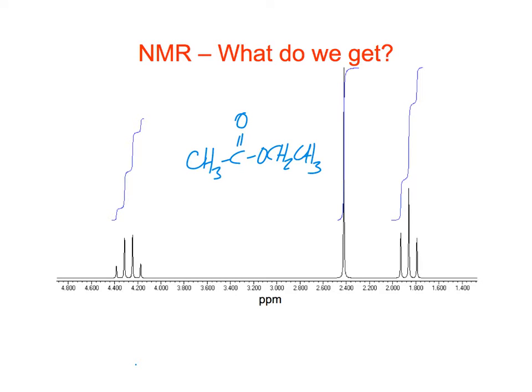But this is a super concentrated sample, and I'm sure they ran it so they didn't have those kind of impurities in there. We'll talk about choosing solvents later, because sometimes, especially if you have very weak, low concentration samples, it's important to choose a solvent that can move that water peak out of the way so it doesn't overlap with signals that you're interested in.